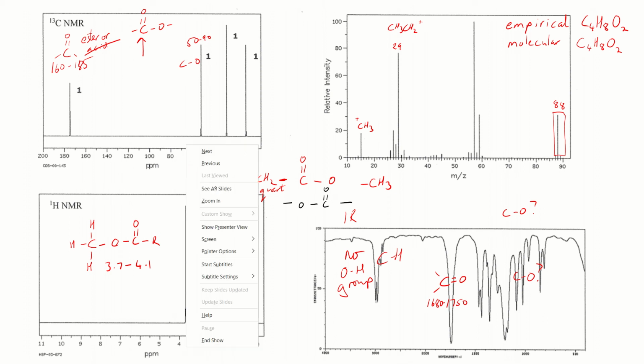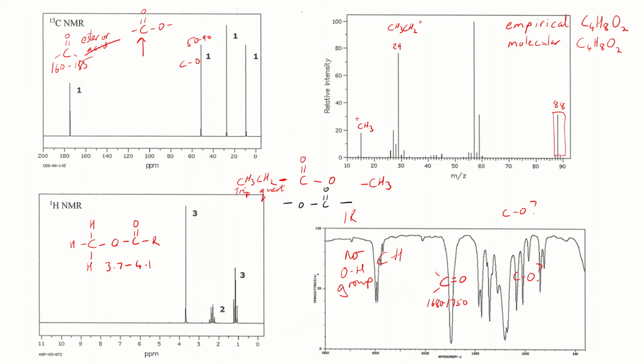If it was next to that, i.e. like that, we would expect this singlet to be in the 2.1 to 2.6 range, which it's not. So therefore, this way is correct. This was a possible alternative, which we've considered. Again, distinction: consider possible alternatives. But we are discounting it because the singlet is not in the correct chemical shift position.